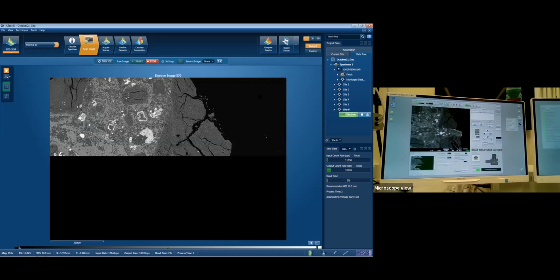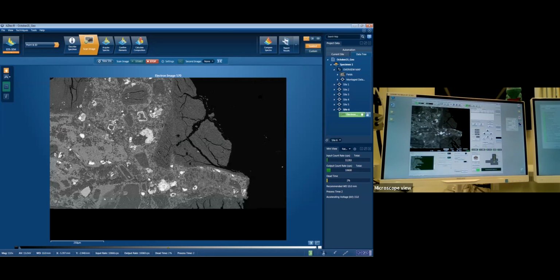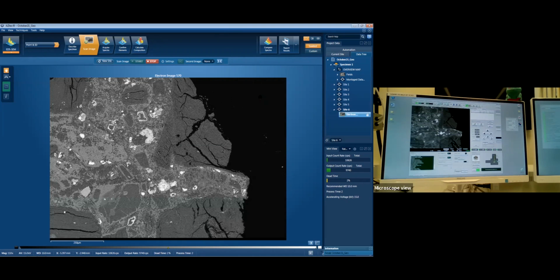Finish pulling across. Well, that looks like a lot of things happening. Yeah, this is a very busy little area. So the bit that I think Nat was referring to is this bit through here.